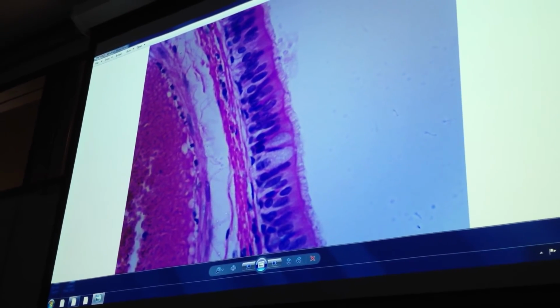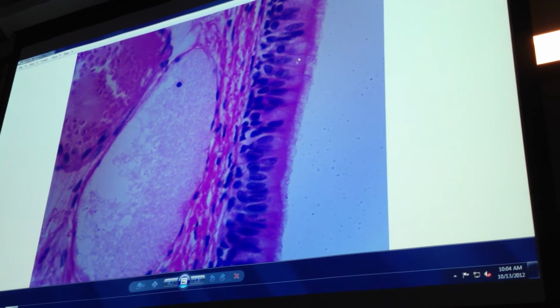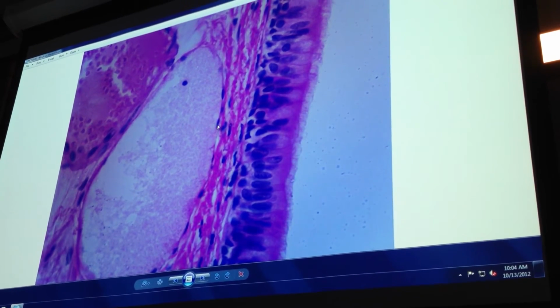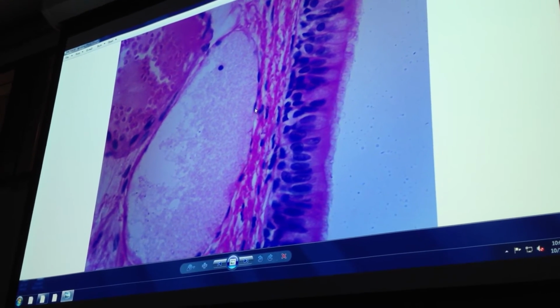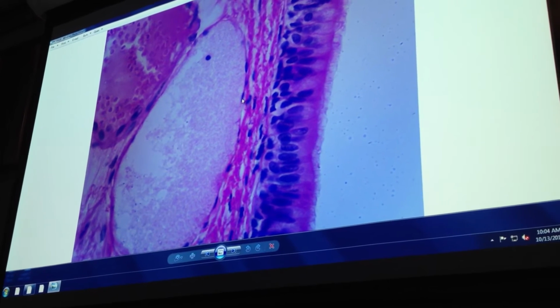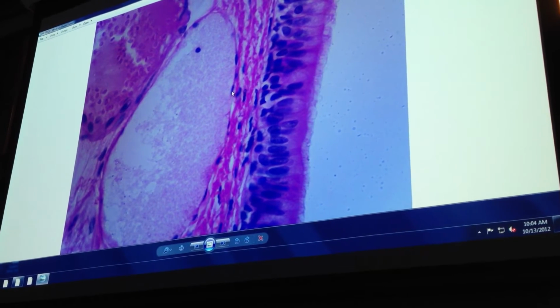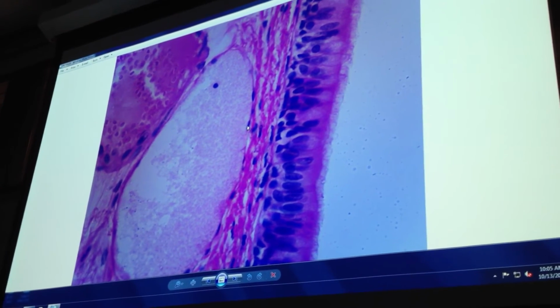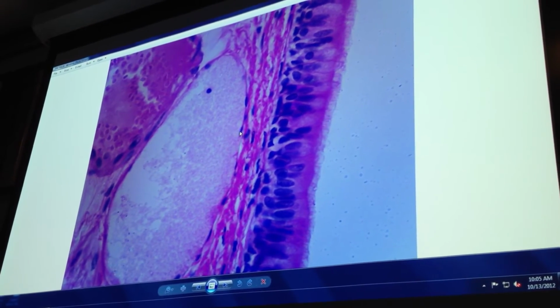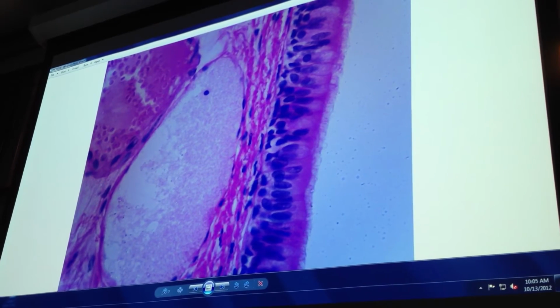Okay, and I've got another one here. This is still pseudostratified ciliated columnar, same stuff. We're looking at this thing right here. Cell type: squamous. Cell arrangement: simple. What's another name for this epithelium in this structure? Endothelium. Yeah, because that's a blood vessel. Remember, in the neck, trachea, blood vessels are everywhere.